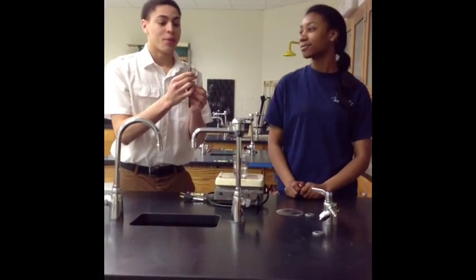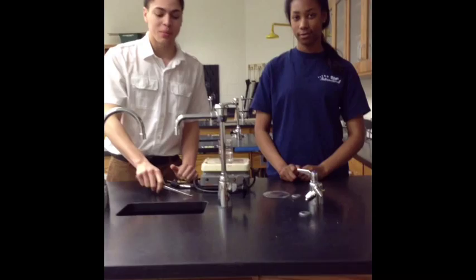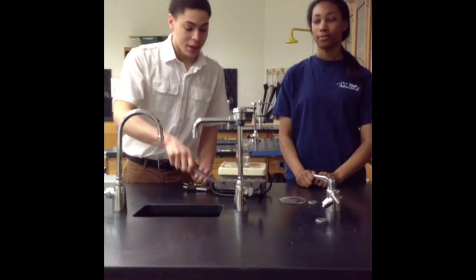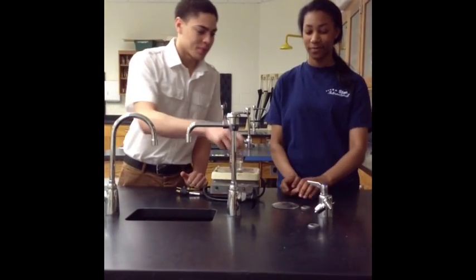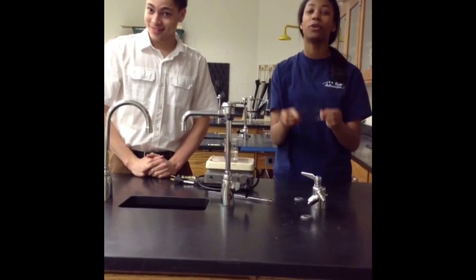Next, we have the forceps. Forceps are used to pick up small objects. Let's say you have some type of rock you want to examine — just pick it up with the forceps. Next, we have the watch glass. You view items through the watch glass.